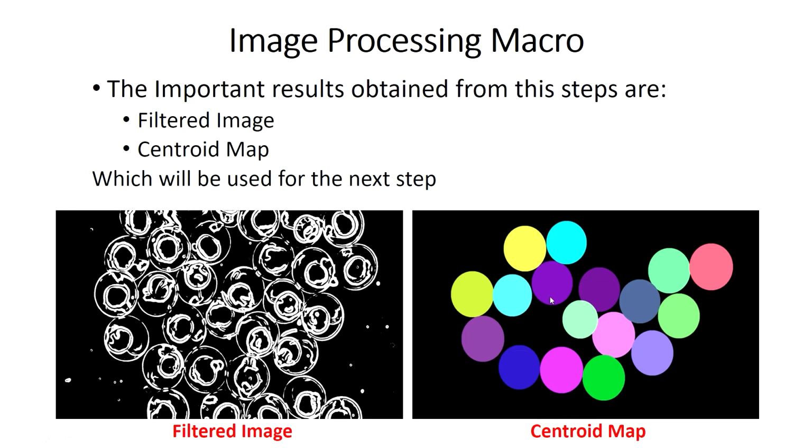By using the threshold tool in ImageJ, it will select all of them based on their color, and then it will be saved in the ROI manager, and it will be used for Z projection of the ROI to see the intensity changes related to time.